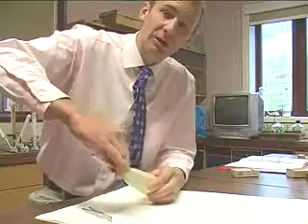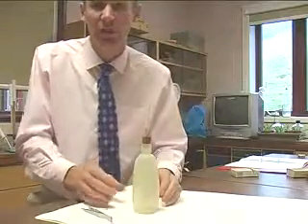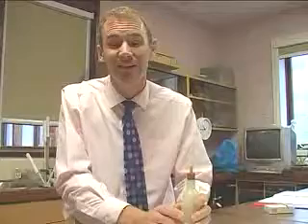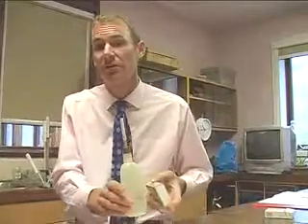We're going to smoke the cigarette in a fume cupboard because cigarette smoke contains 4,000 different chemicals, including formaldehyde, hydrogen cyanide, benzene and nitrosamines, and none of those chemicals are good for you. So we'll do this in the fume cupboard over here.